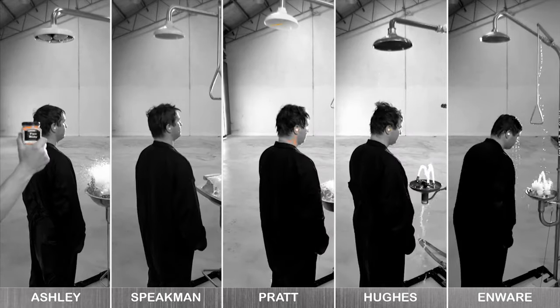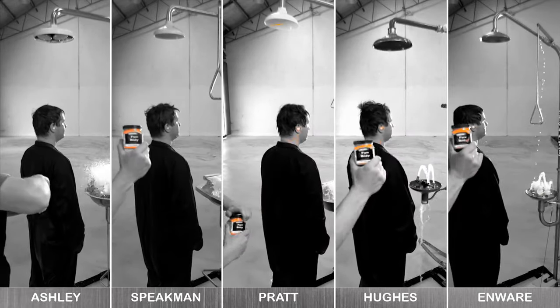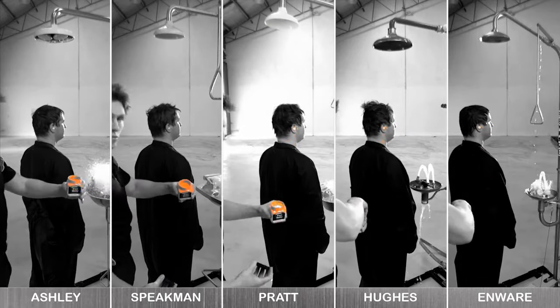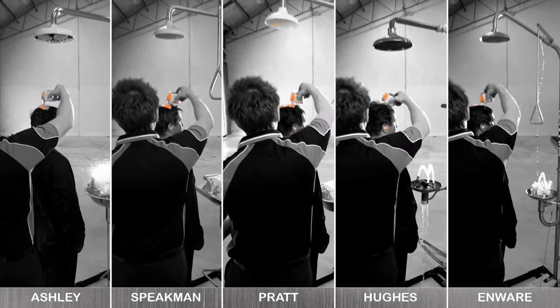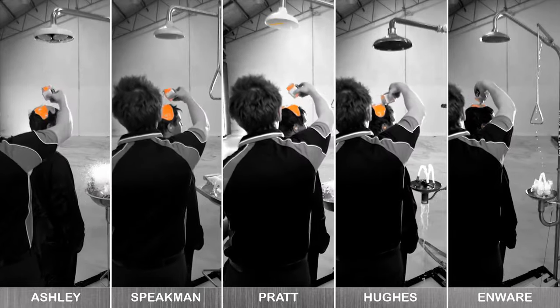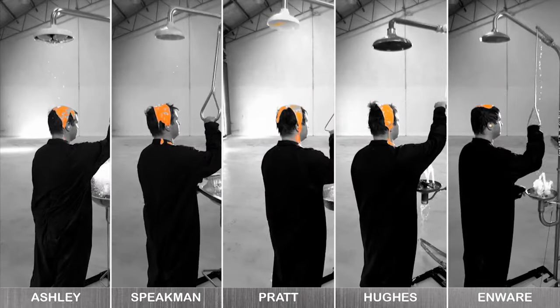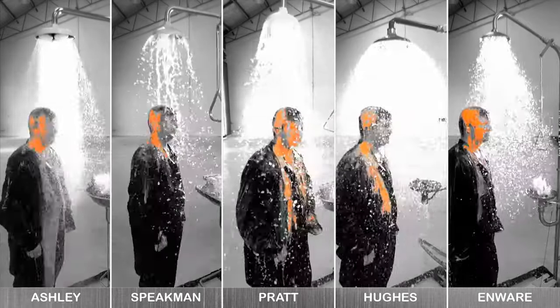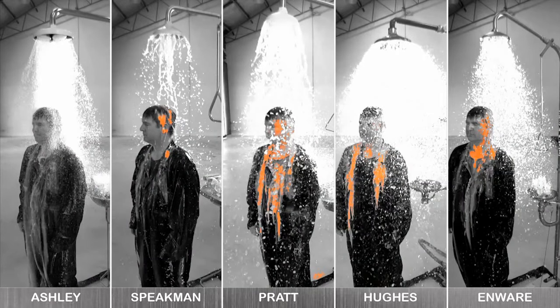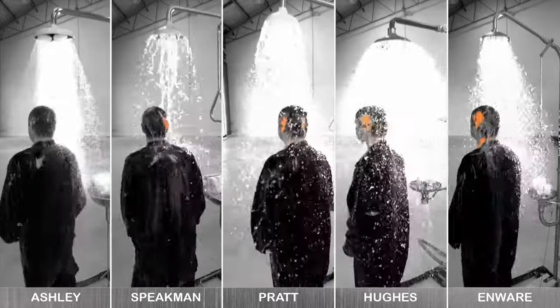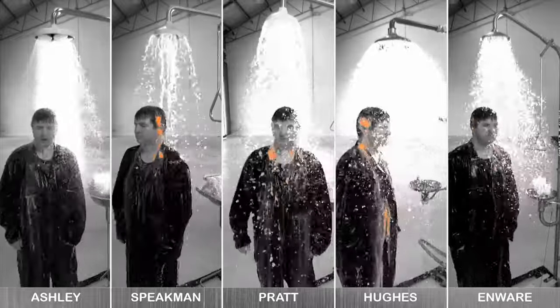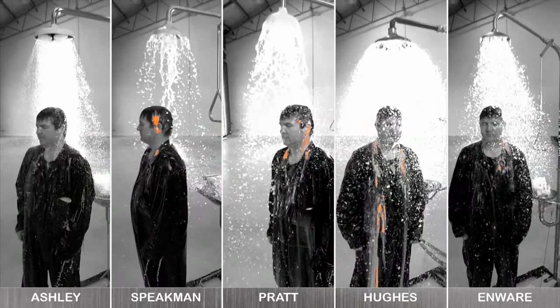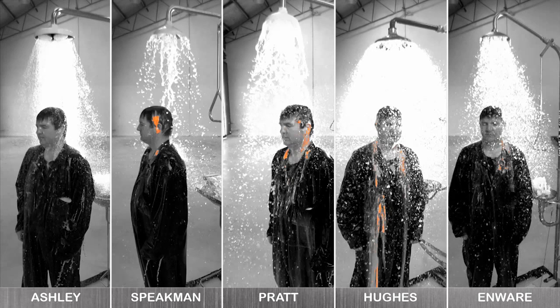In this demonstration, we'll be using an acrylic body paint to simulate our chemical. Each time the same amount of paint will be applied to the user, and the same water pressure and volume will be deployed in the same time. Look how quickly and effectively Ashley's shower removes the orange chemical. At this point there's virtually no chemical remaining. A final look indicates that Ashley's shower not only removes the chemical quicker, but it removes more chemical than any other shower in the allotted time.